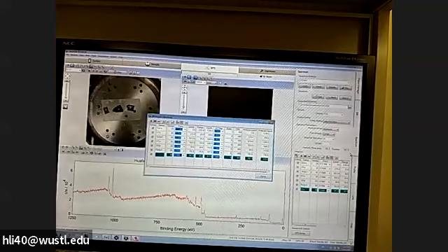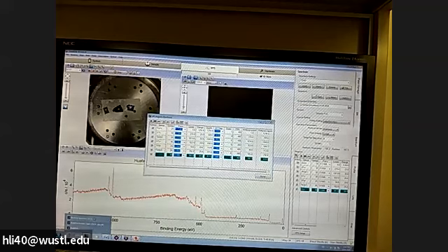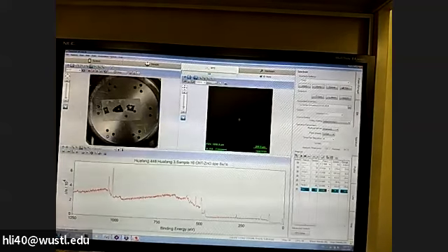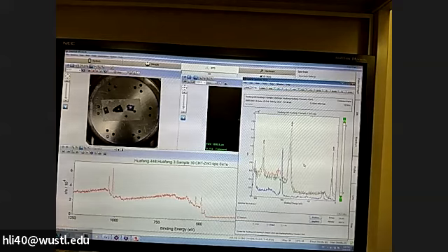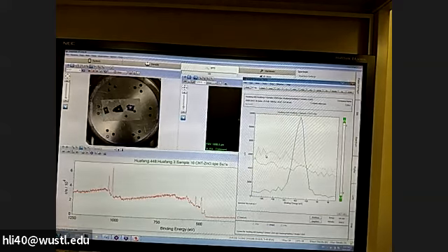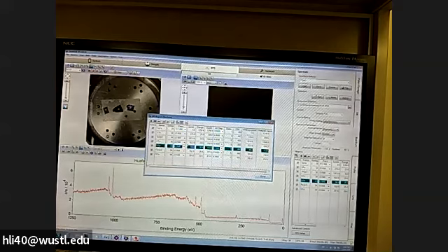If we include all the elements, this sample will take about 2.5 hours, which is pretty long. So let's fine tune this a little bit. For silicon, the default is 94. We just check the range for all these three. Silicon is around here, 99. This is the silicon peak. So the range will be 96 to 106.